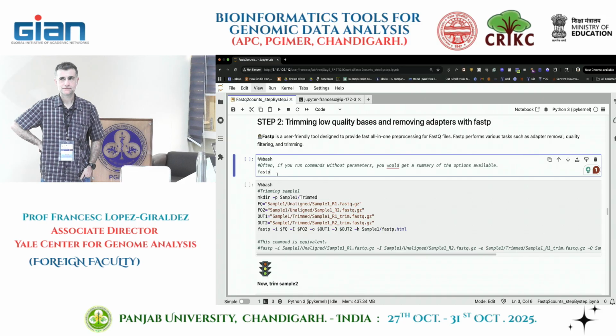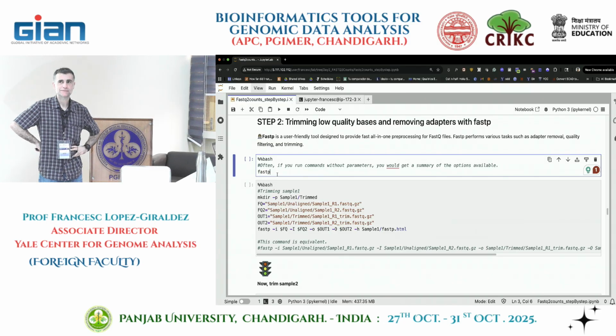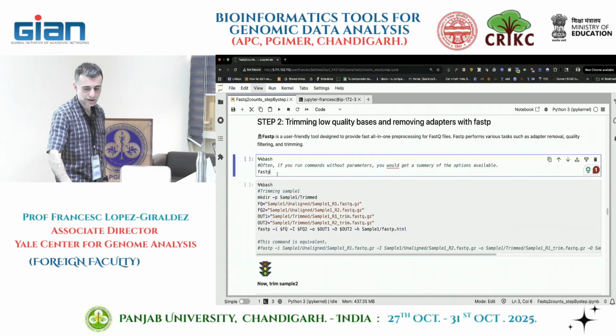You can also say I want R1 to have 200 cycles and R2 to have 100 cycles. So you can set any combination you want. The only thing is it will only do 300 cycles, whichever way you want it to do. Maybe if he said 150, the initial reagent may not be enough for another 150. Yeah, exactly. He mentioned that there are different reasons why the quality drops.